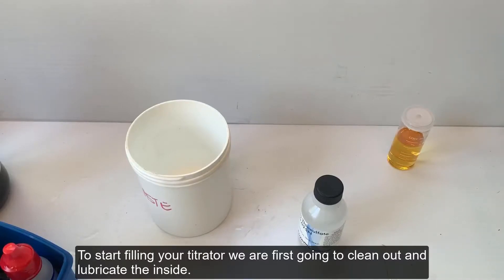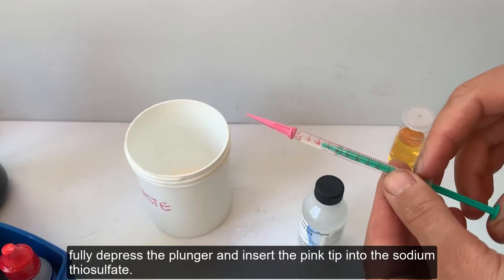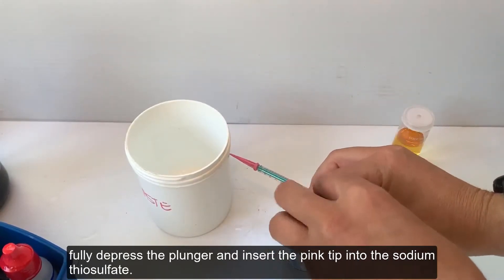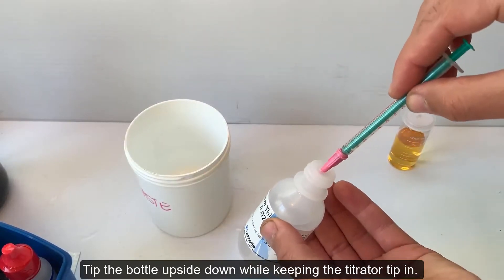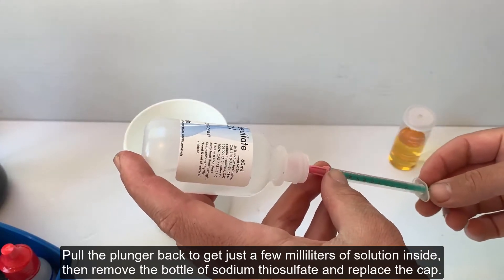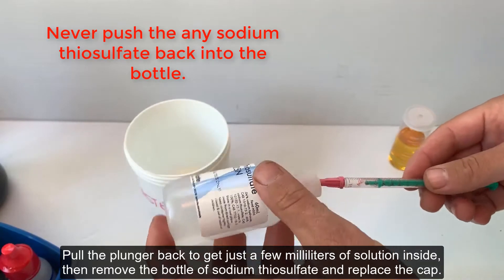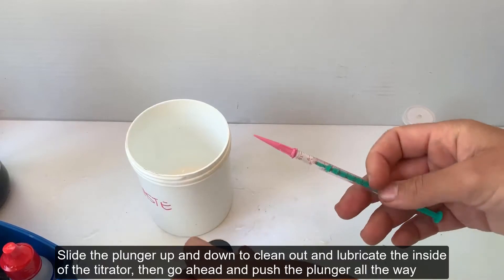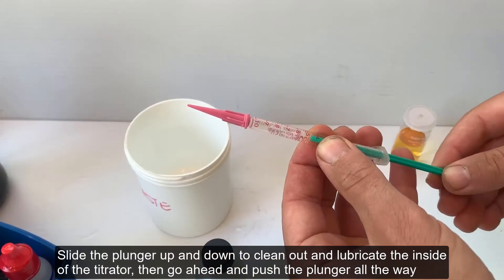To start filling your titrator, we are first going to clean out and lubricate the inside. Fully depress the plunger and insert the pink tip into the sodium thiosulfate. Tip the bottle upside down while keeping the titrator tip in. Pull the plunger back to get just a few milliliters of solution inside, then remove the bottle of sodium thiosulfate and replace the cap. Slide the plunger up and down to clean out and lubricate the inside of the titrator.